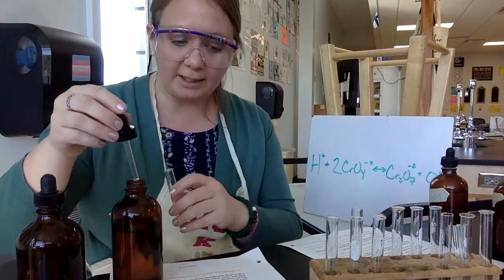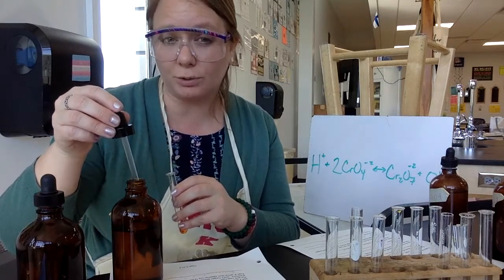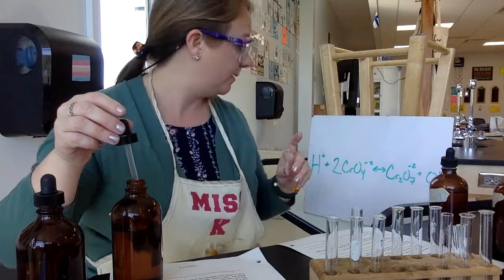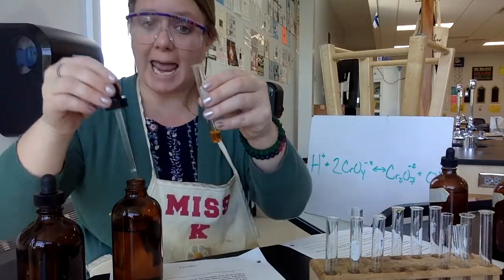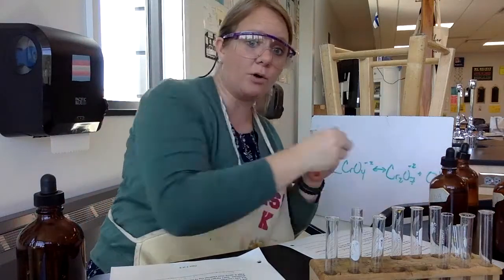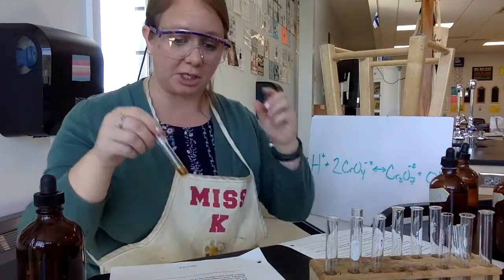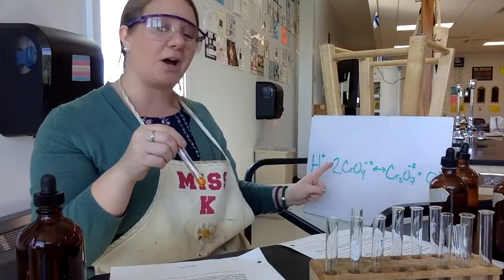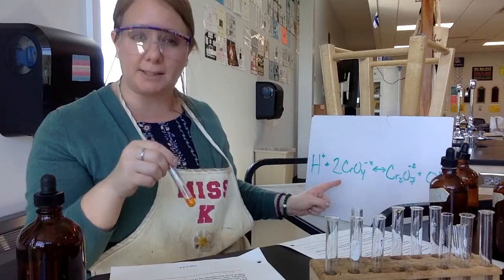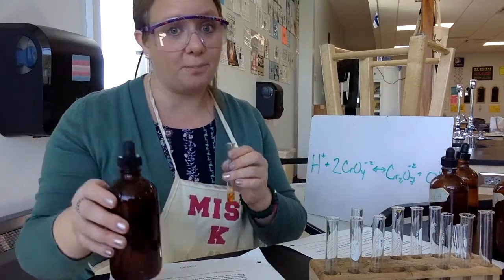Go ahead and fill in the blank where it says this will shift the equilibrium. So there are essentially only which ions? Which are we forcing? Yep, the Cr2O7. I add a little bit, and as we predicted, it stayed that orangey color because we made it shift in that direction. Even though we know these are in equilibrium, I've got a really small amount of that CrO4. So again, I'm going to add a couple drops of the barium nitrate.